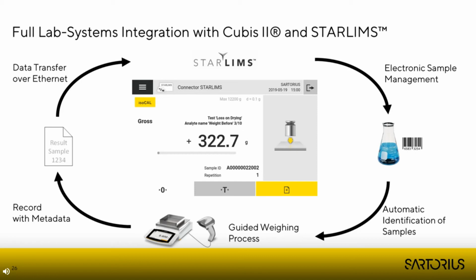The modern web service-based technology allows us to design something that is much better than the traditional way of setting up these balance LIMS connections via RS-232 or file transfer.